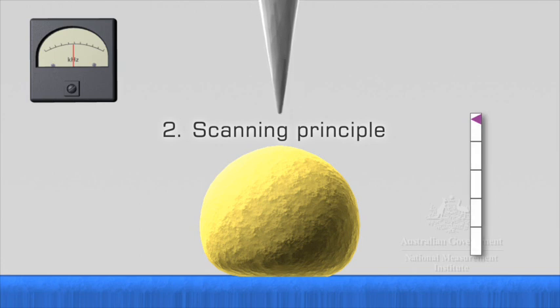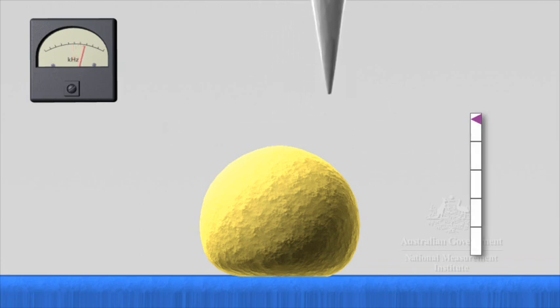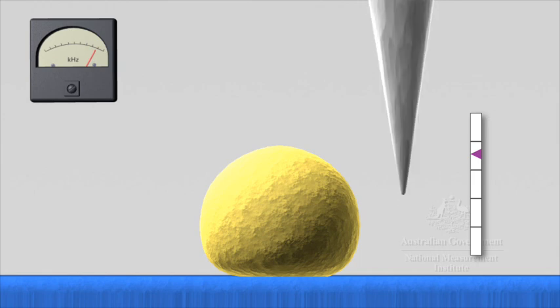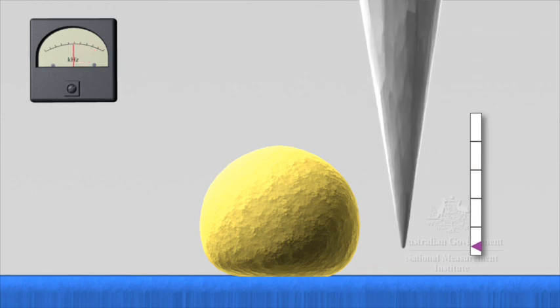2. Scanning Principle. If the tip is scanned across the sample, the tip height is adjusted by feedback to keep the cantilever vibration at the set point and the distance between the tip and the sample constant.